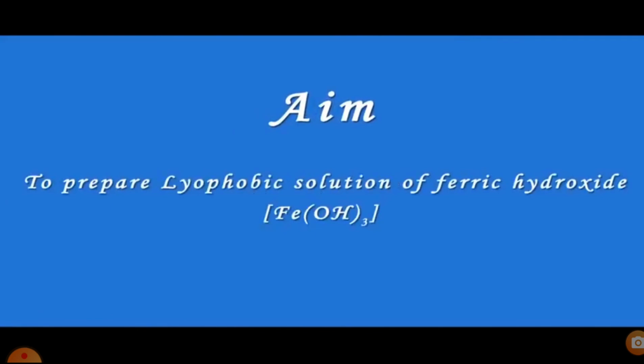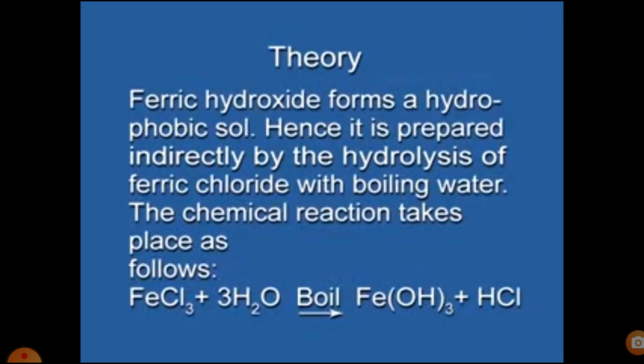Aim: to prepare lyophobic sol of ferric hydroxide. Theory: ferric hydroxide forms a hydrophobic sol. Hence, it is prepared indirectly by the hydrolysis of ferric chloride with boiling water.